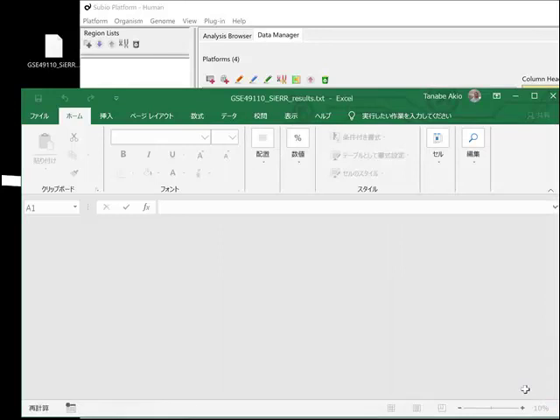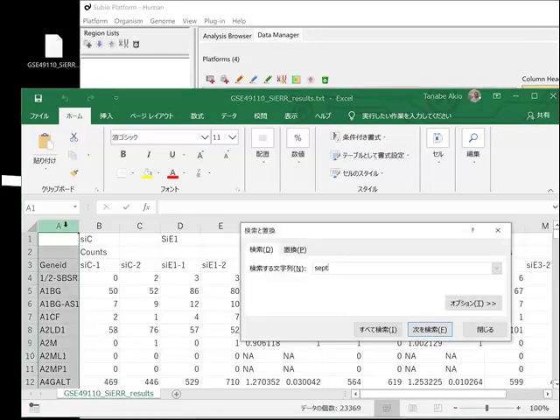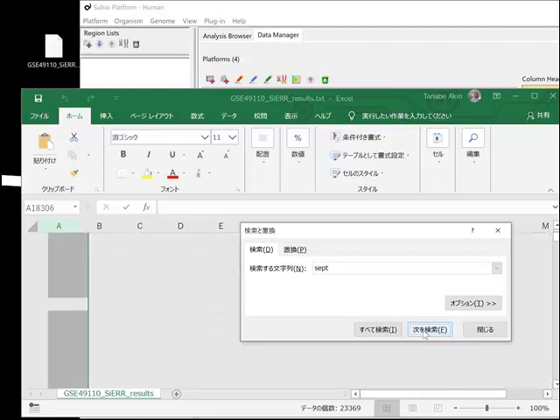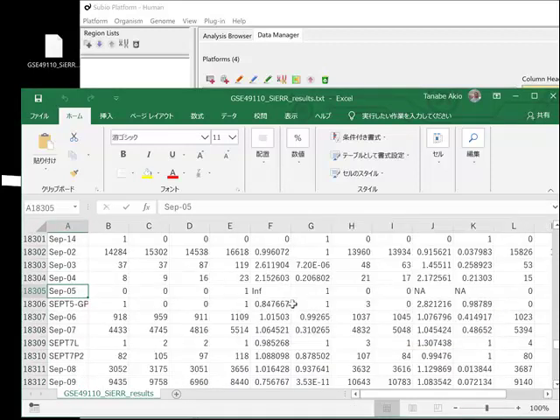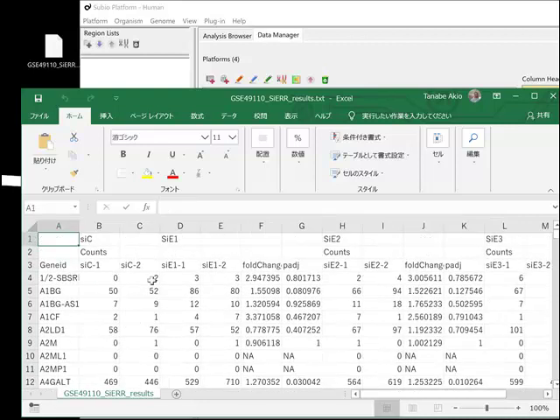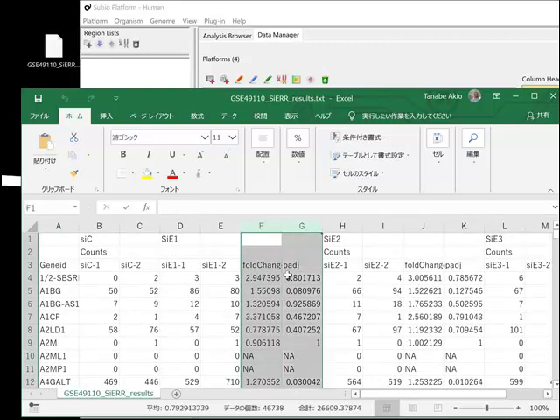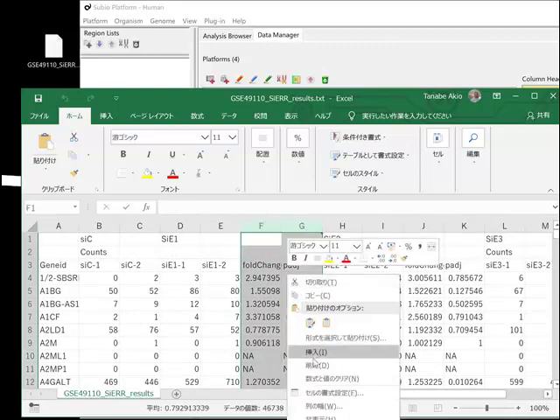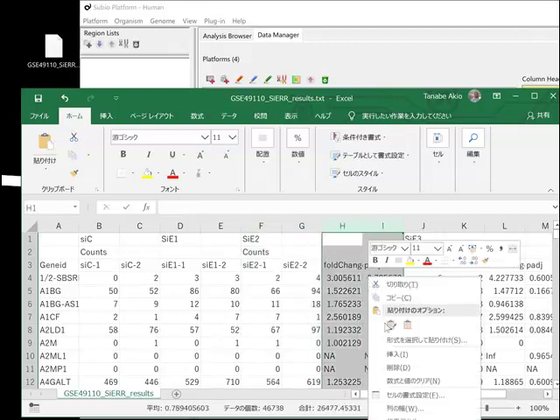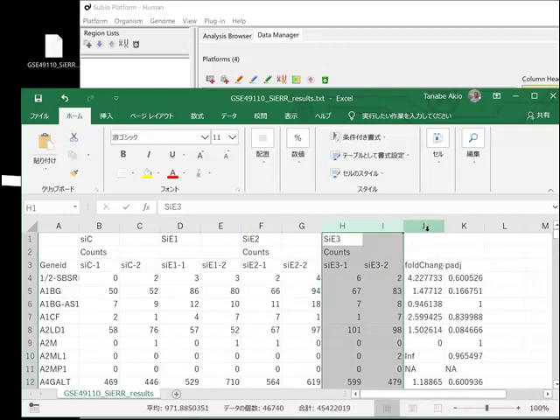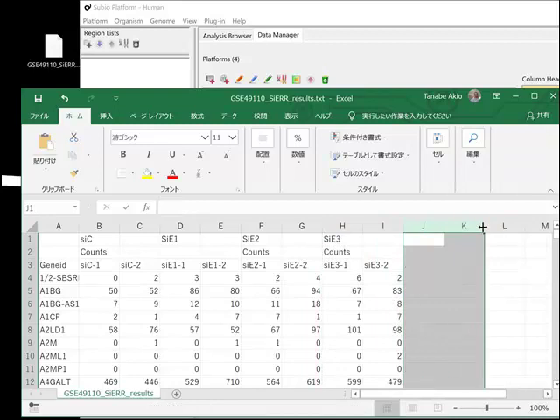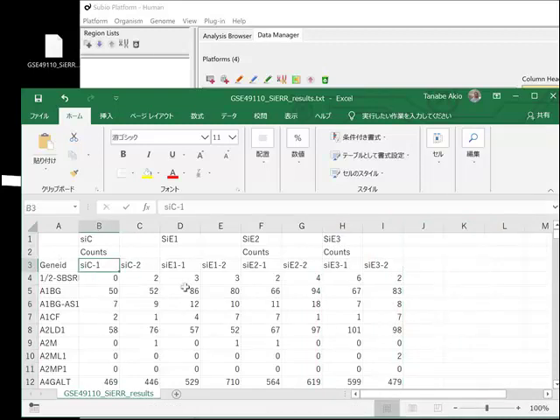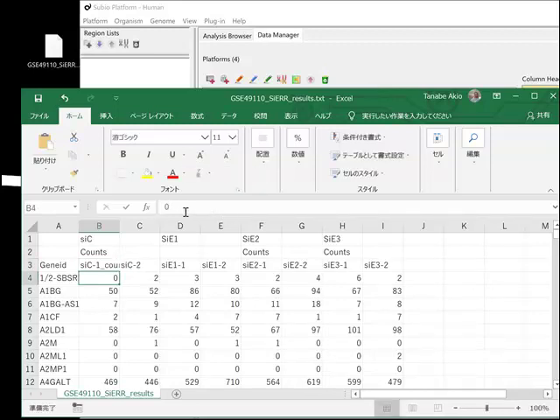Check if it handles gene symbols correctly. Delete unnecessary columns and rows. It's a good idea to mark these values as counts to avoid confusion in the future. Save and overwrite it.